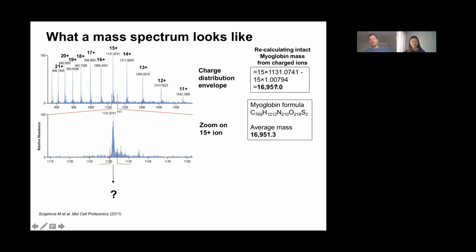And you can see here that from the data, we are 0.3 Daltons off from this simple calculation.